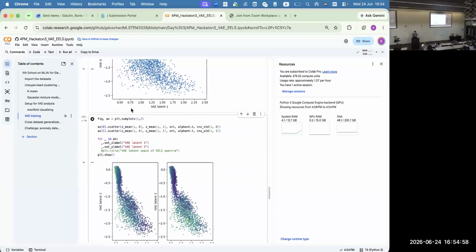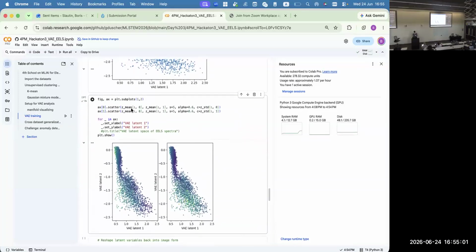The only thing I would like to pay attention to, which I think is quite important if we speak about variational autoencoders, is the difference between variational autoencoders and autoencoders in general: variational autoencoders have a probabilistic encoder, meaning that we find not a deterministic representation of our high-dimensional data in the latent space, but rather we find a small distribution.